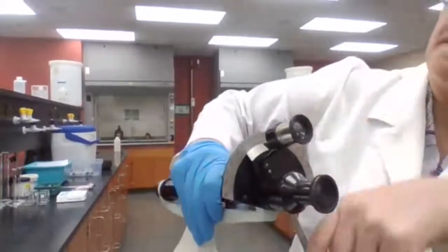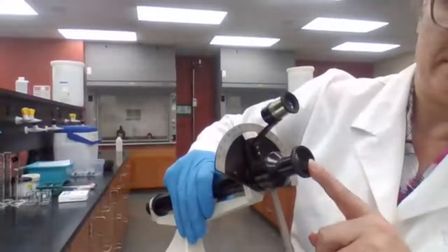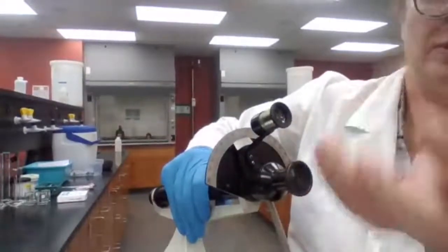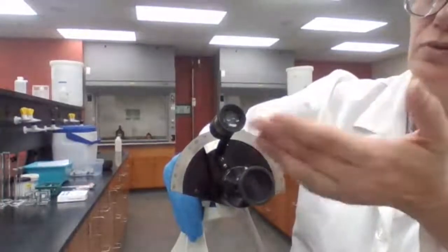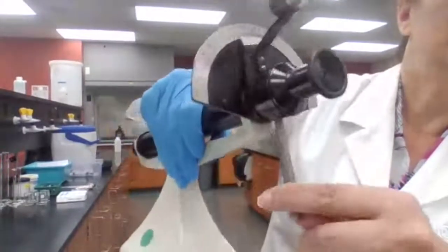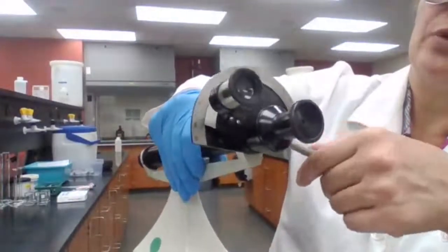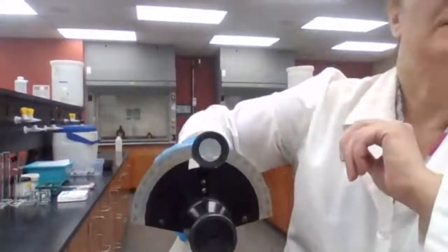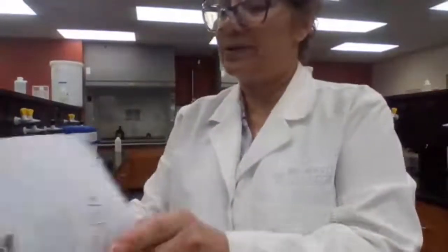So it would have been a better experience if you could have seen through the eyepiece yourself, looking through the magnifying glass. But when I'm using it, I'm going to try to keep as close as possible to the camera, and hopefully you can make more sense out of this. There's a moving piece here, and there is a fixed plate. And how much are we going to move? We are going to move until the two half circles are the same shade again.